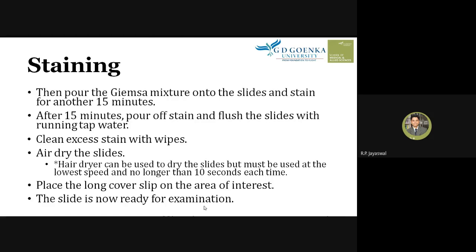After 15 minutes, you wash out the stain and put the slide under running tap water so that you can remove the excess stain stuck with the smear. Using the wipes, means tissue paper, you can clean excess stain stuck on the slide from the back side or the front side.